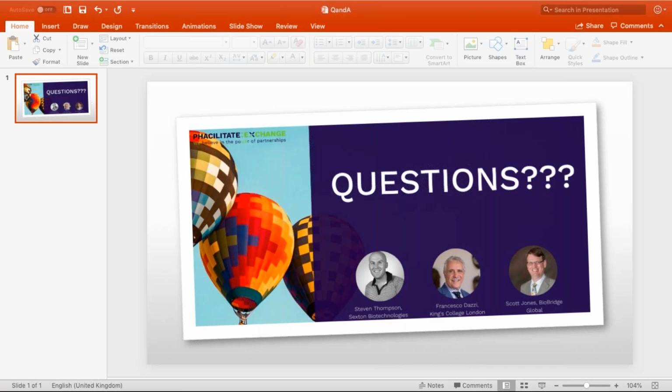Yeah, that's a good question. I can say what we're doing: we're trying to look out there for technologies. What I kind of envisioned, basing it on what we see in donor screening, is it would be really nice to have some kind of general platform that would be fully automated that could possibly do your PCR-based assays and your ELISA-based assays.